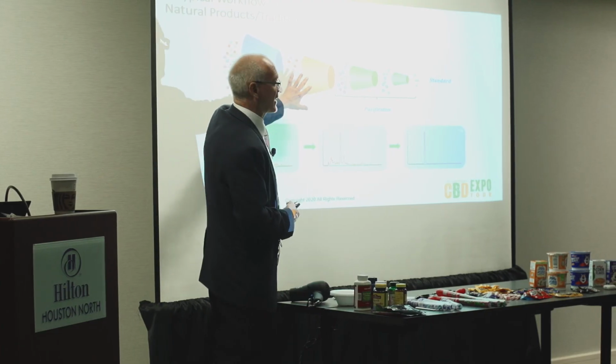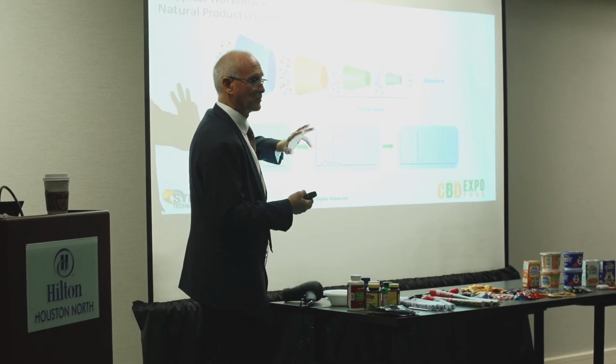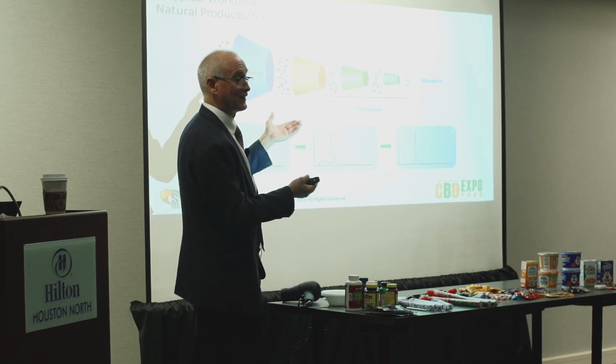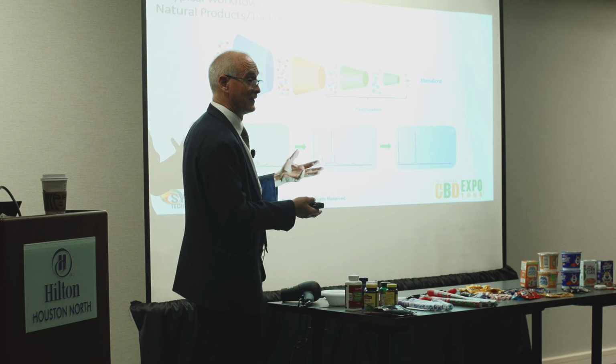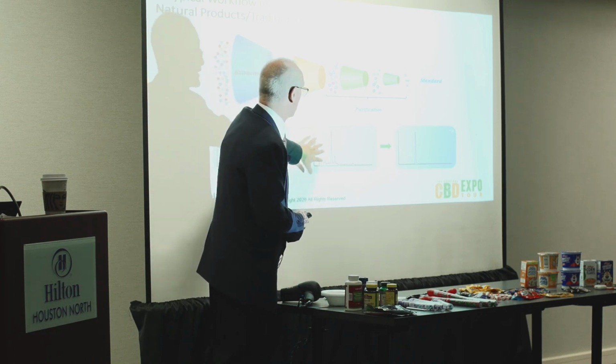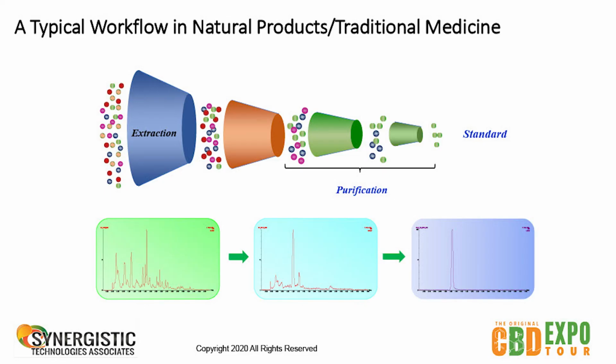Now you do an extraction, so now you've taken away some of those balls because you've separated some, same as the coffee. You're not getting the coffee grounds in your coffee cup, hopefully; they're all left behind. That's the same thing that's happening here, so now you have less. And then you talk about purification and people talk about isolate. What you're really doing is making a single molecule.